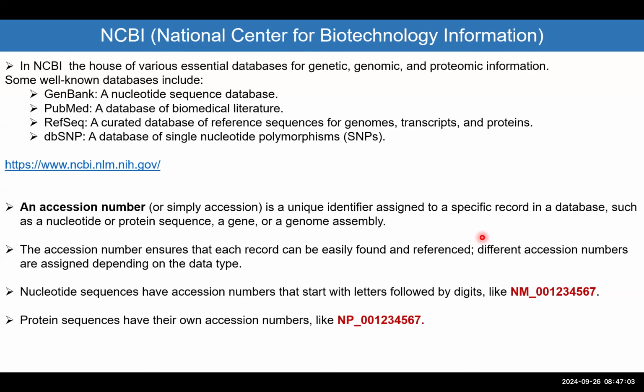And there are many other tools. Now, for you particularly, I'm not going to make it so complicated, because I don't assume that tomorrow you're going to go somewhere and start performing an experiment where you need to dig yourself into the NCBI without any support. Plus, some of the things that I'm going to show you would probably be covered better in a bioinformatics course. So I'm just giving you the basics here.